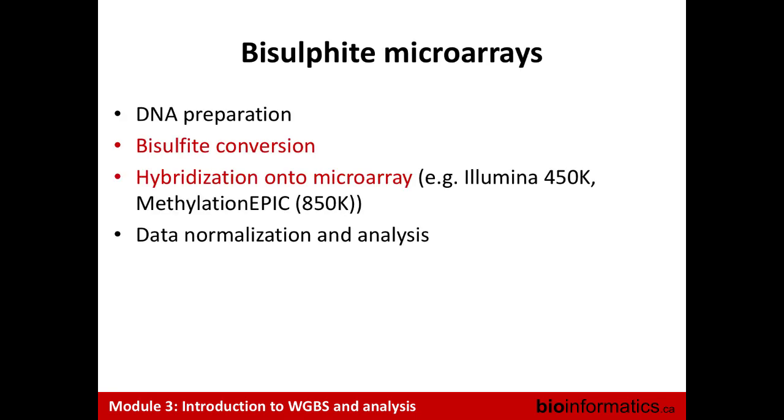So I wonder, what is the efficiency of bisulfite conversion? Is it always 100% or is it lower? That's a good question. We'll get to that a little bit, absolutely. Depending on how much you do the treatment, you can either damage the cells too much or not convert them enough.